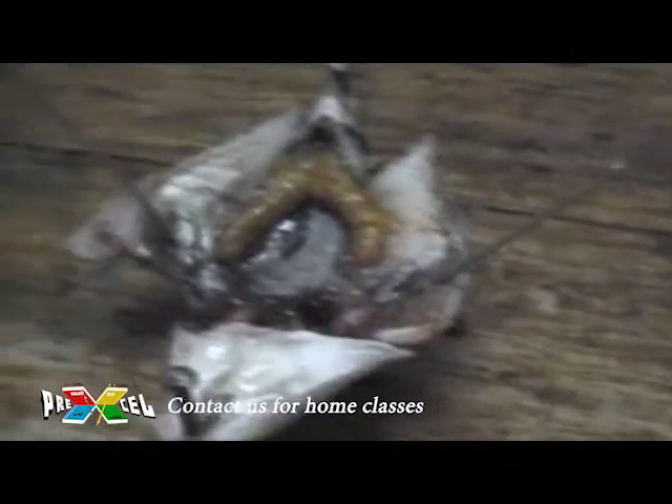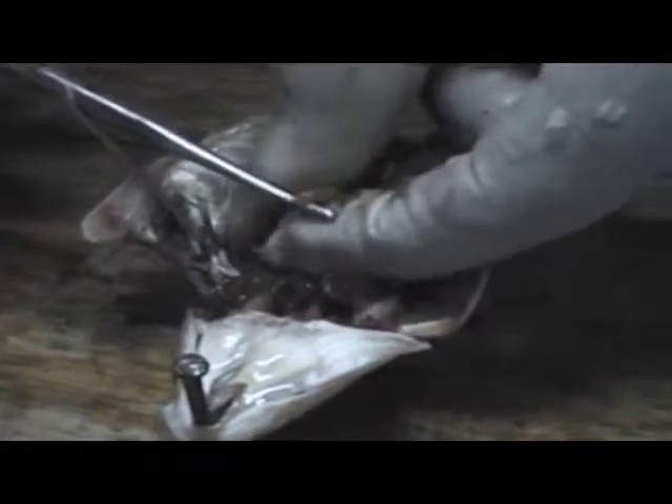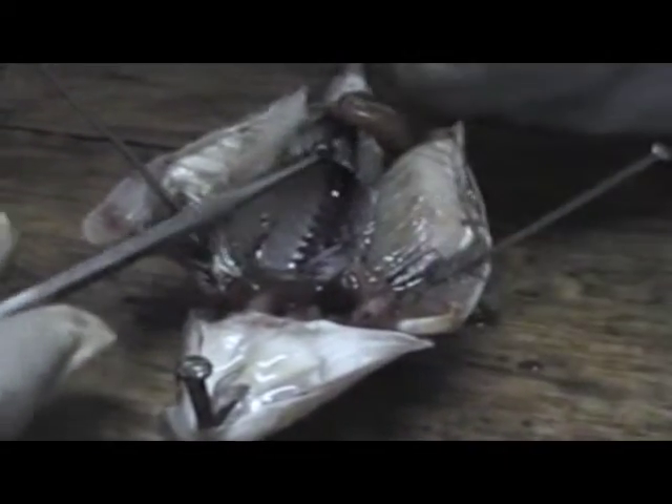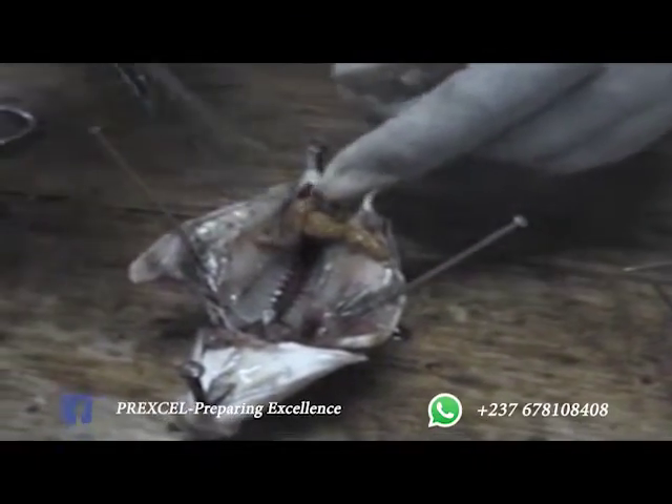These are the urinogenital system of a female — the genital system of a female fish. This is the swim bladder we talked about; if you burst it, you see that air will come out and it goes down. We keep our oviduct containing eggs here — the ovaries. Then we remove the swim bladder and you are seeing the kidneys. We place the ovaries on one side so that the kidneys are very visible.